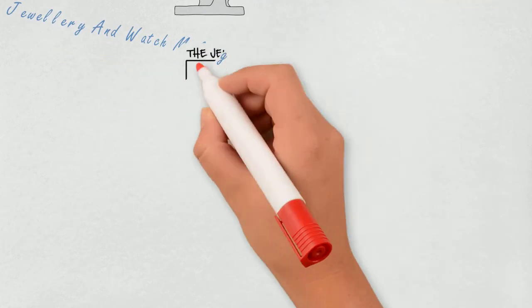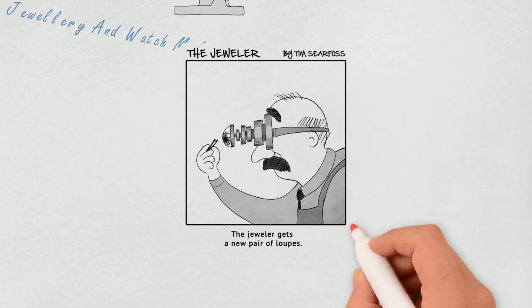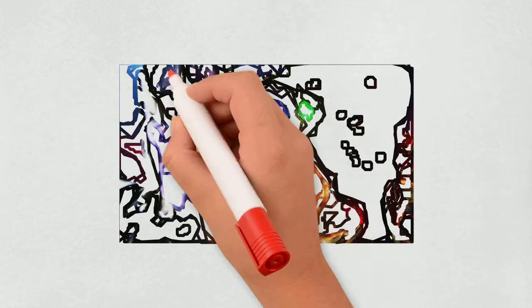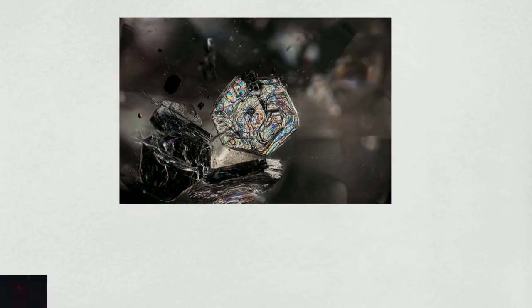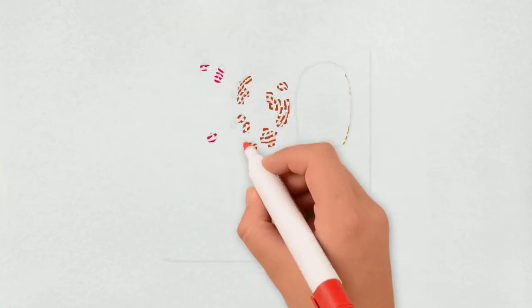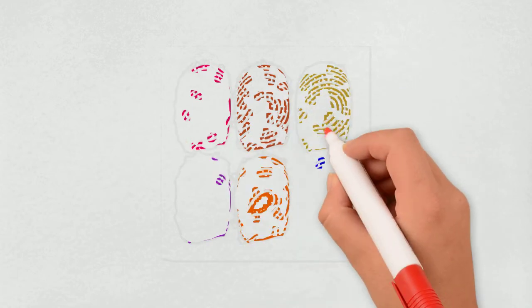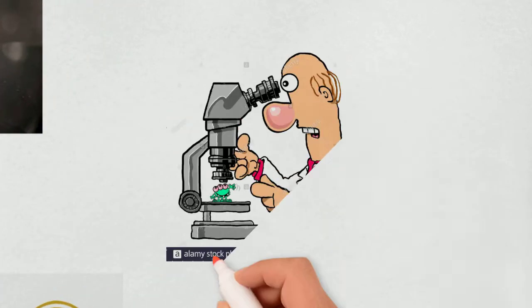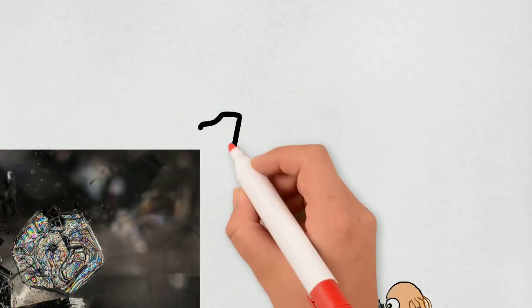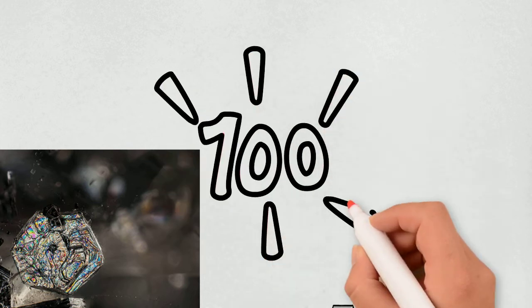One of the fields is jewellery. When working with gemstones, quality assurance is always a top priority. Using a binocular stereo microscope, they can look deeper into the stone for any unusual characteristics, which are signs of enhancement, filling, and so on. This unique inclusion acts like a fingerprint and helps easily identify certain gem types. After this test is completed, they can be almost 100% certain of the gemstone and its quality.